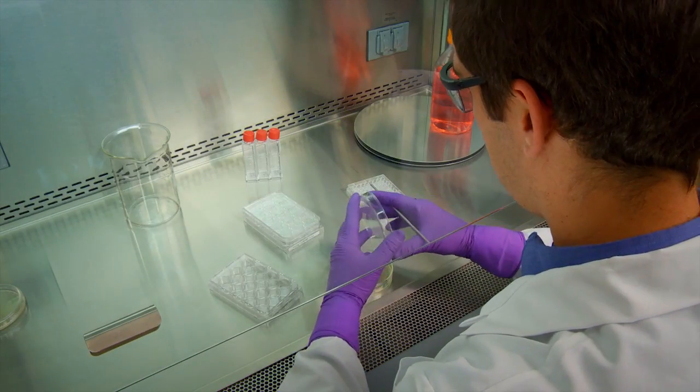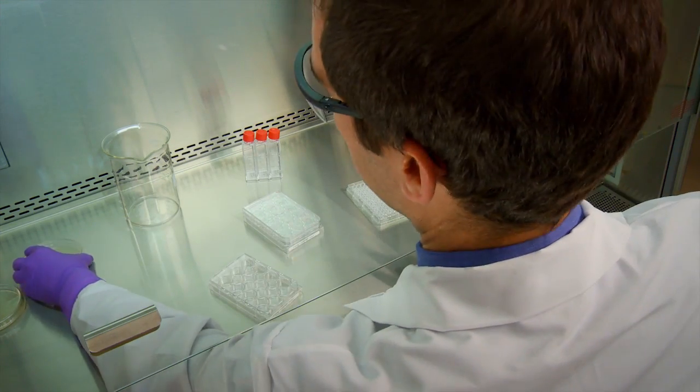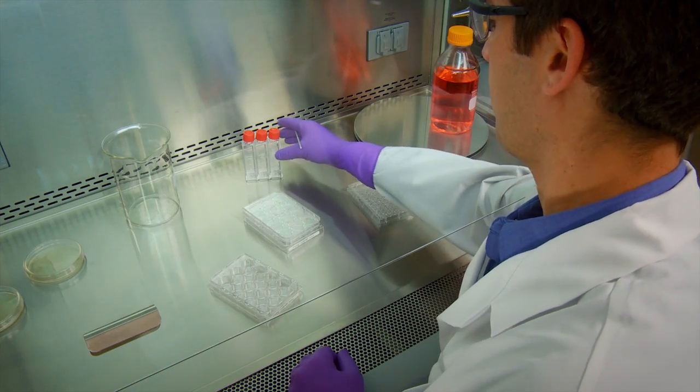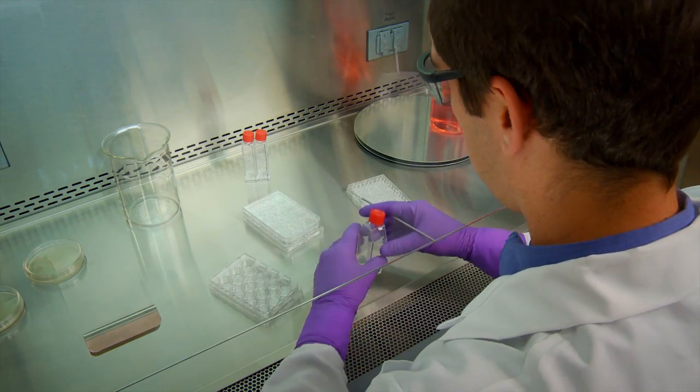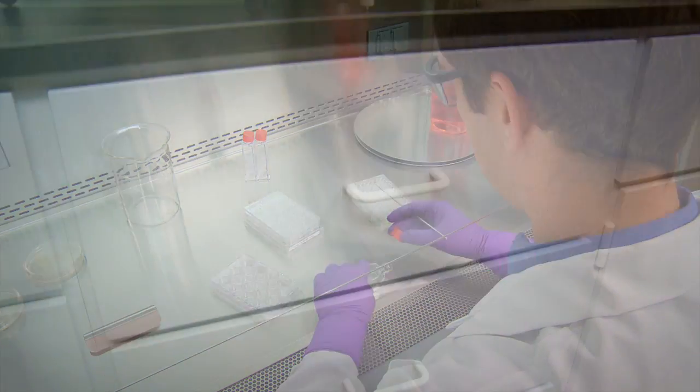NuAir Biological Safety Cabinets provide the largest effective work zone area available, which helps reduce arm, neck, and shoulder strain. A shorter reach into the work zone brings the proper work area closer to the user, minimizing fatigue.